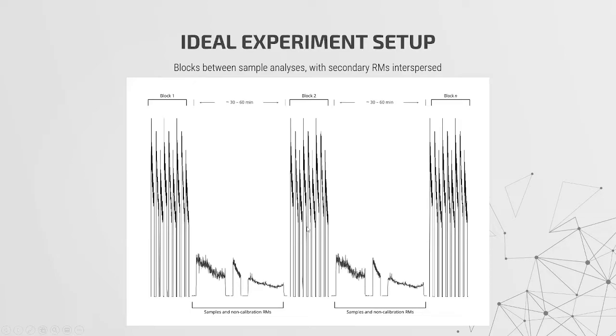In the examples that we use here, we've collected quite a few scan lines across our reference materials, and it's a little bit of overkill, I guess you could say, but it was to sort of prove the concepts.